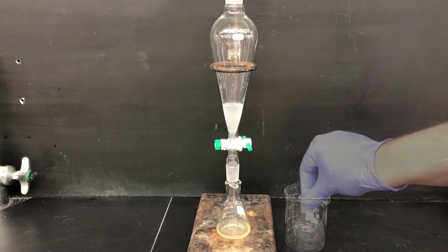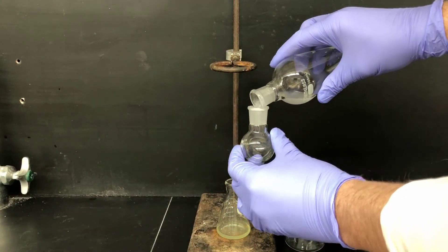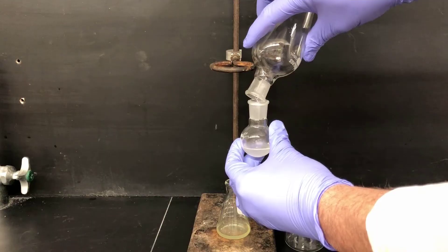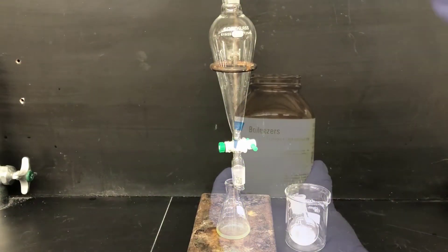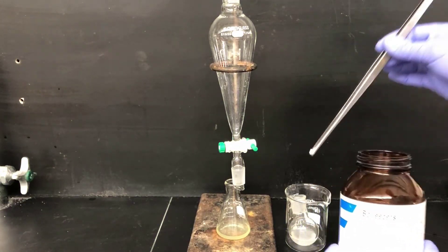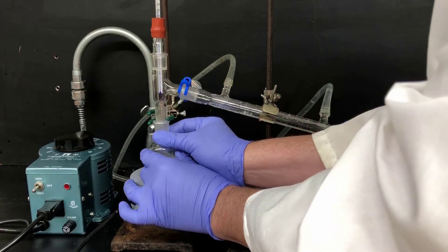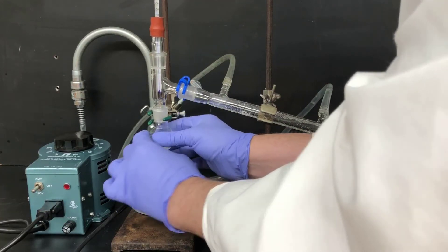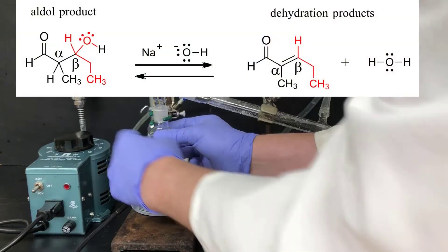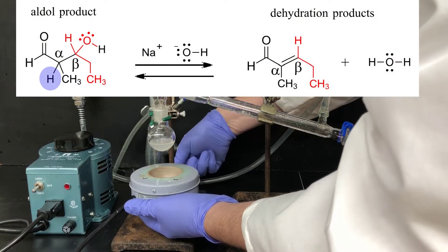Then I'll pour the upper product-containing layer into a round bottom flask to distill it. Remember, the distillation flask should be about half full, so I've selected a 25 milliliter round bottom flask here and added a couple of boiling chips. Now I'm going to carry out another distillation. The purpose of this distillation is quite different from the first one.